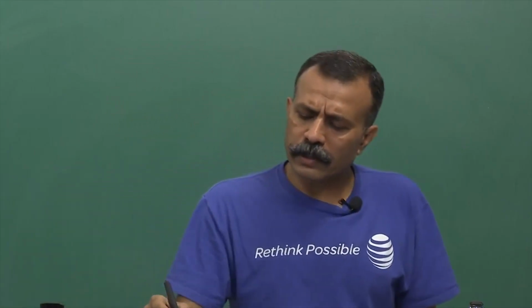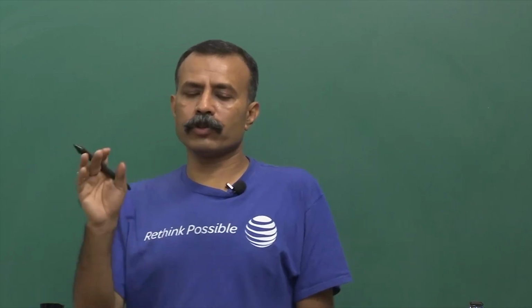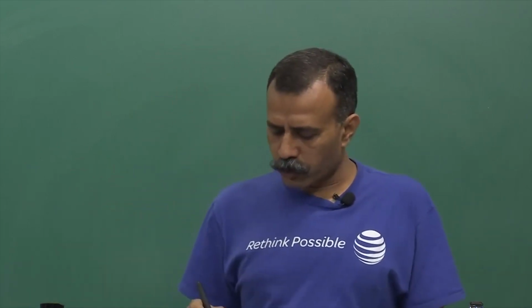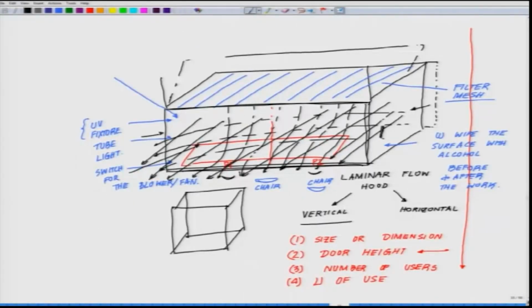So, these are some of, and of course, you want to have a bunch of pipettes, which most of these labs use as dedicated ones for this kind of dissecting hood. Generally, I personally used to prefer those glass walls on both sides to keep the pipettes somewhere like this. You can have a system where you are not exposing them, and you have sterilized pipette tips kept inside, something like this.